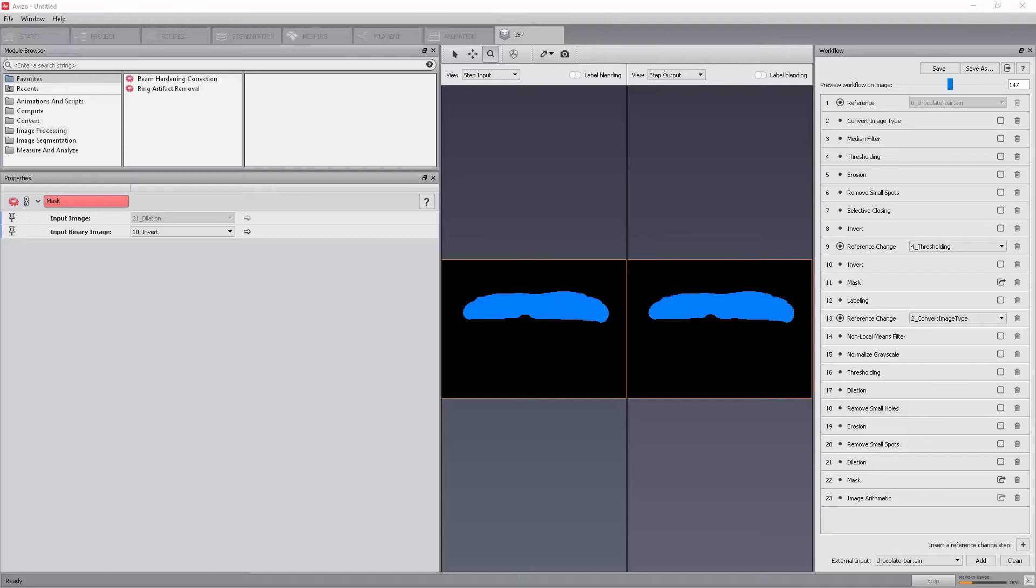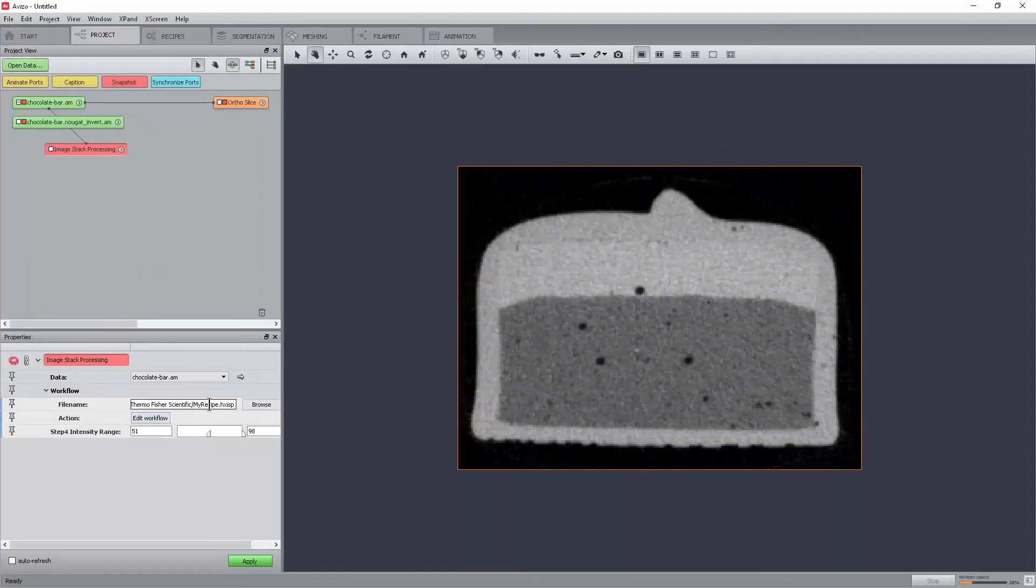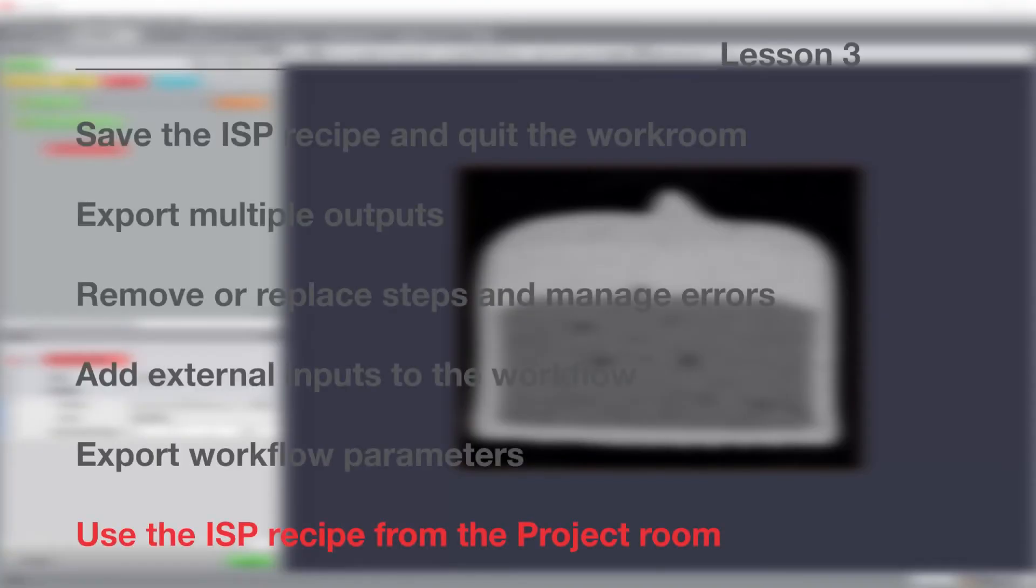Any parameters can be exported using the pin icon from the properties panel. When the icon is pinned down, the parameter will be available directly from the image stack processing module in the project workroom. Click on the thresholding step and click on the pin icon of the intensity range parameter. Go back to the project workroom and select the image stack processing module. Look at the properties panel. The intensity range is now available and can be changed.